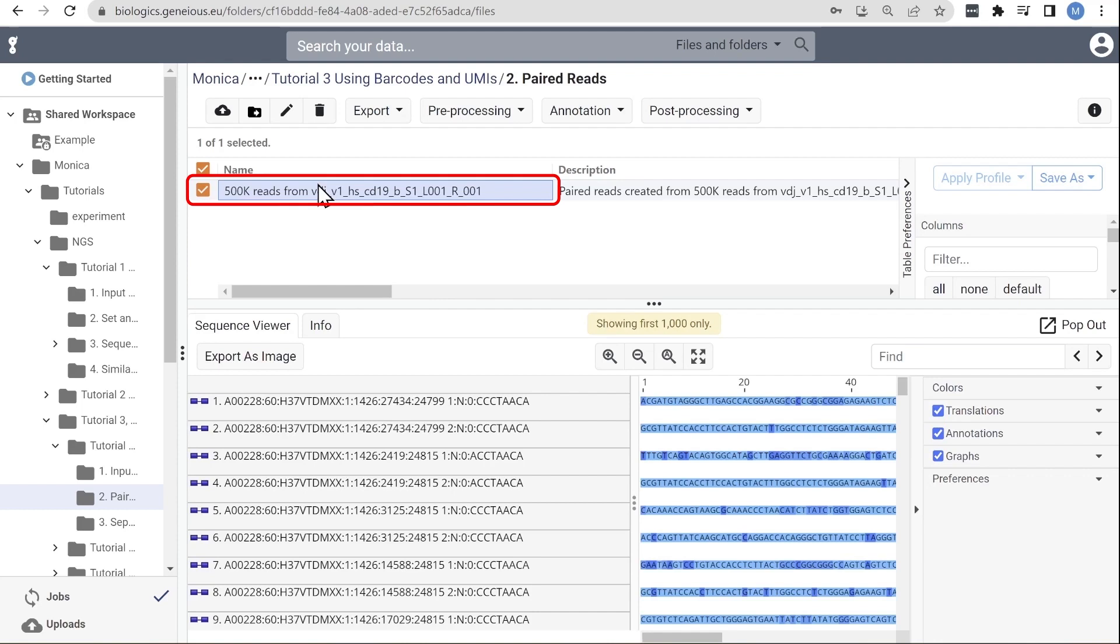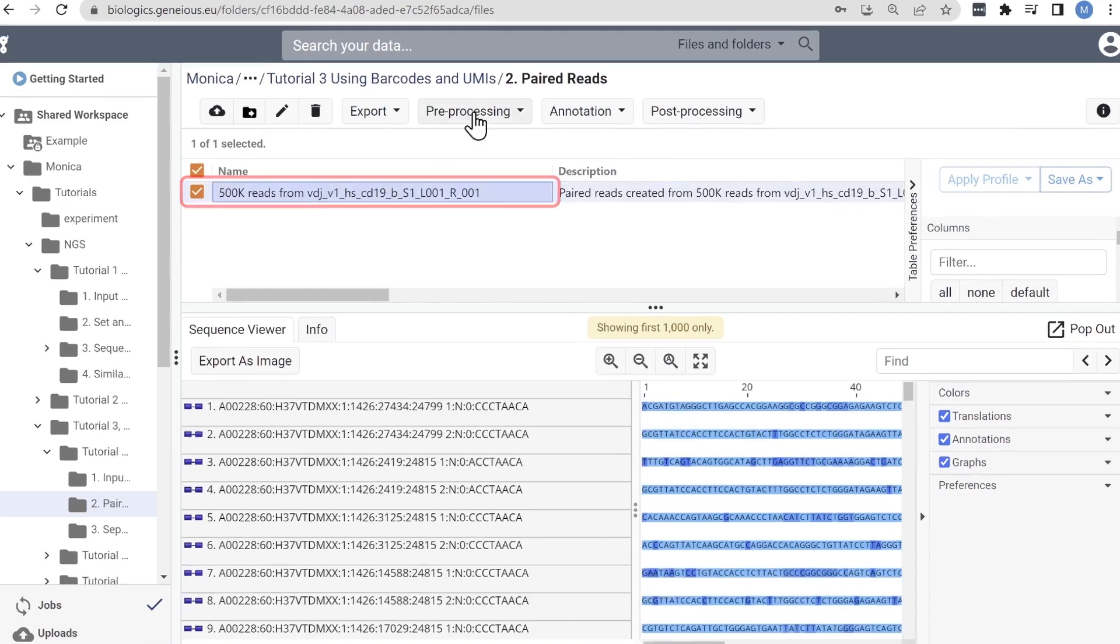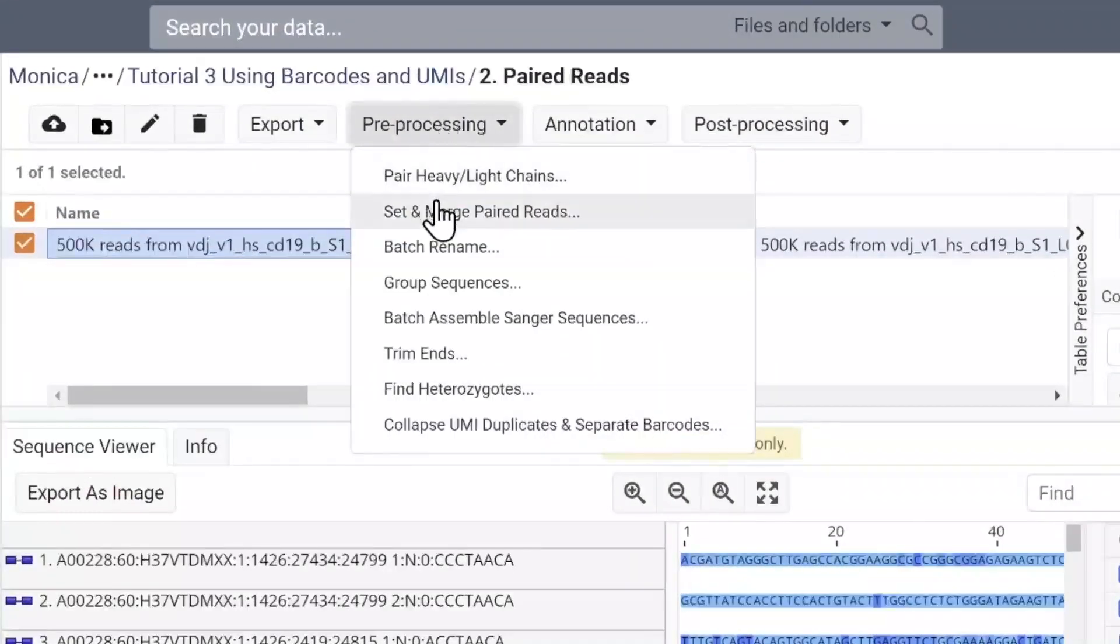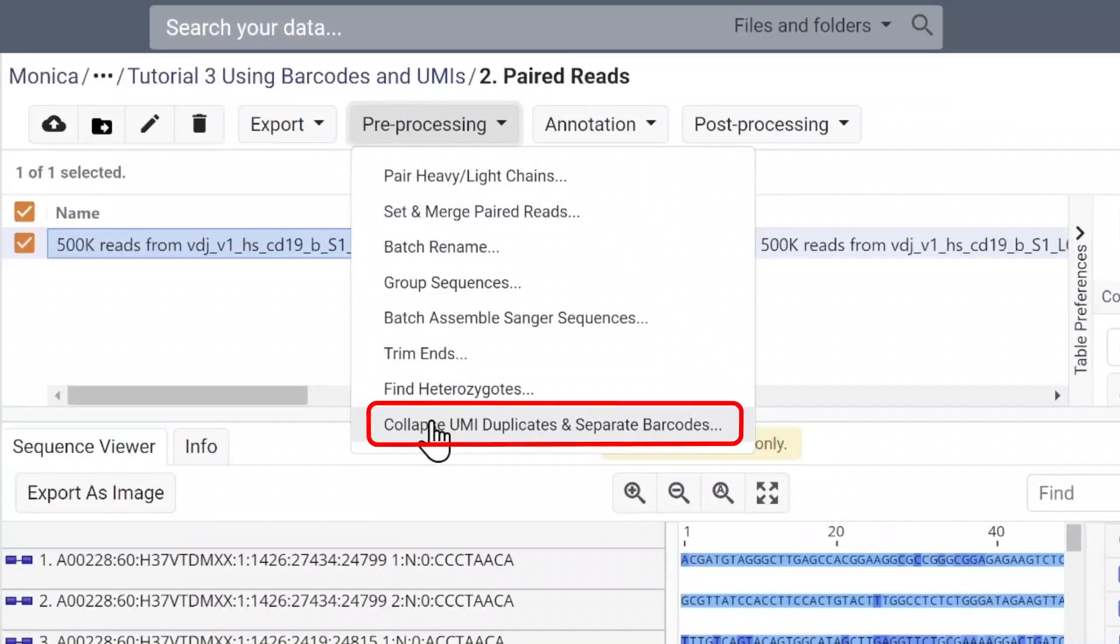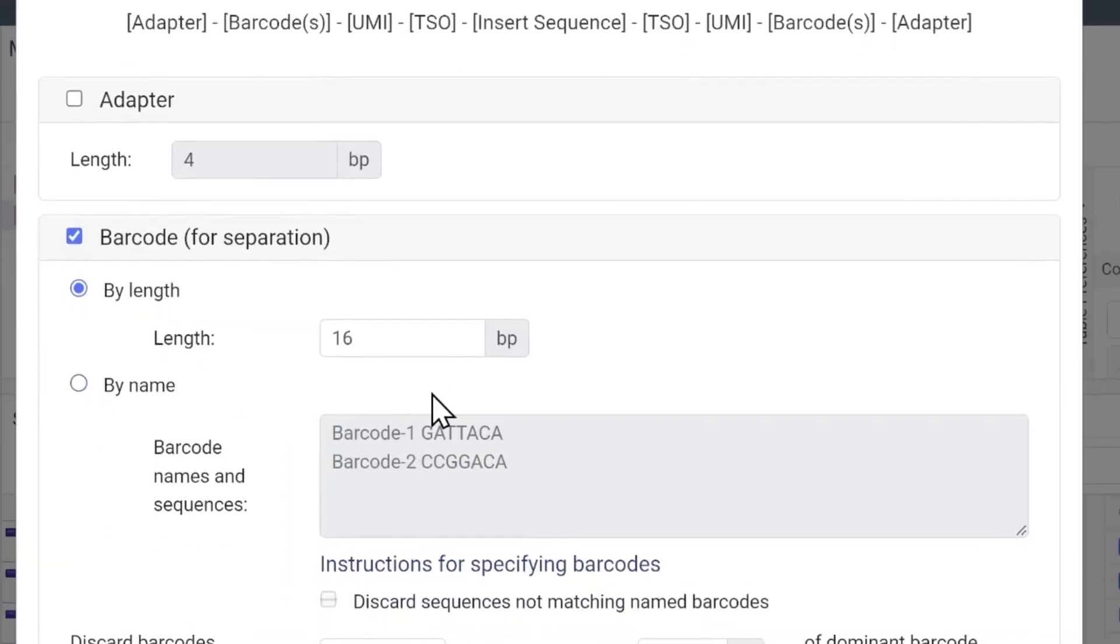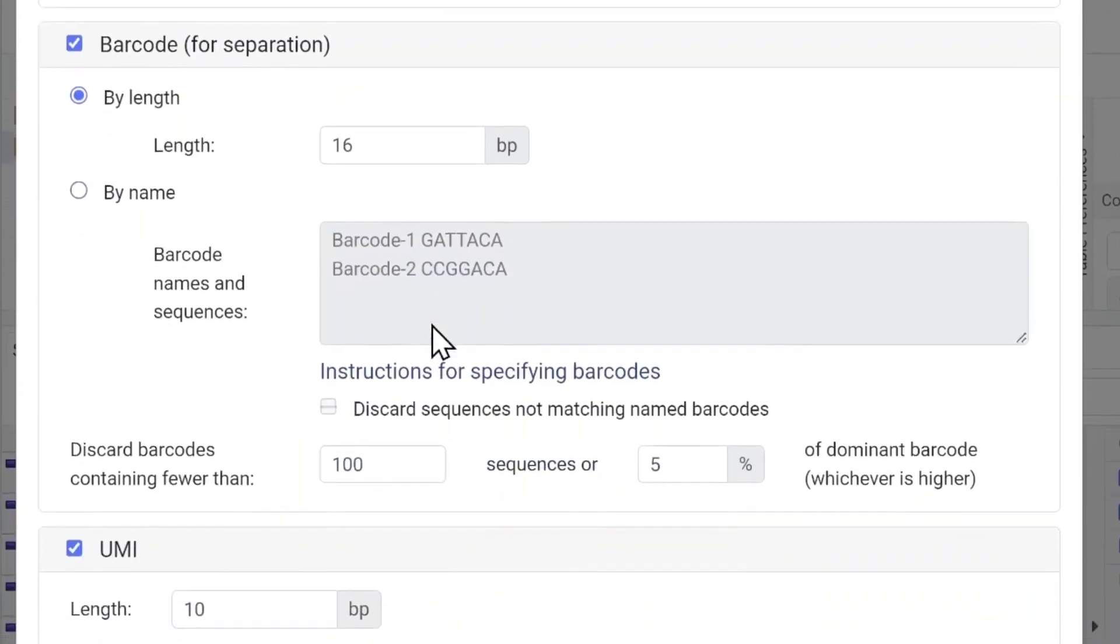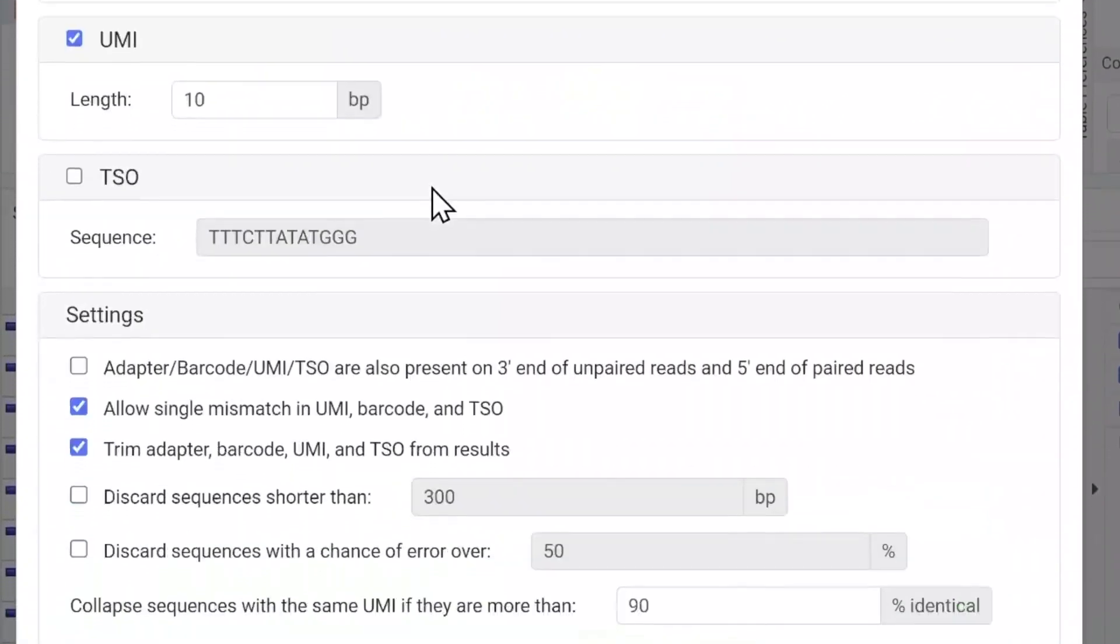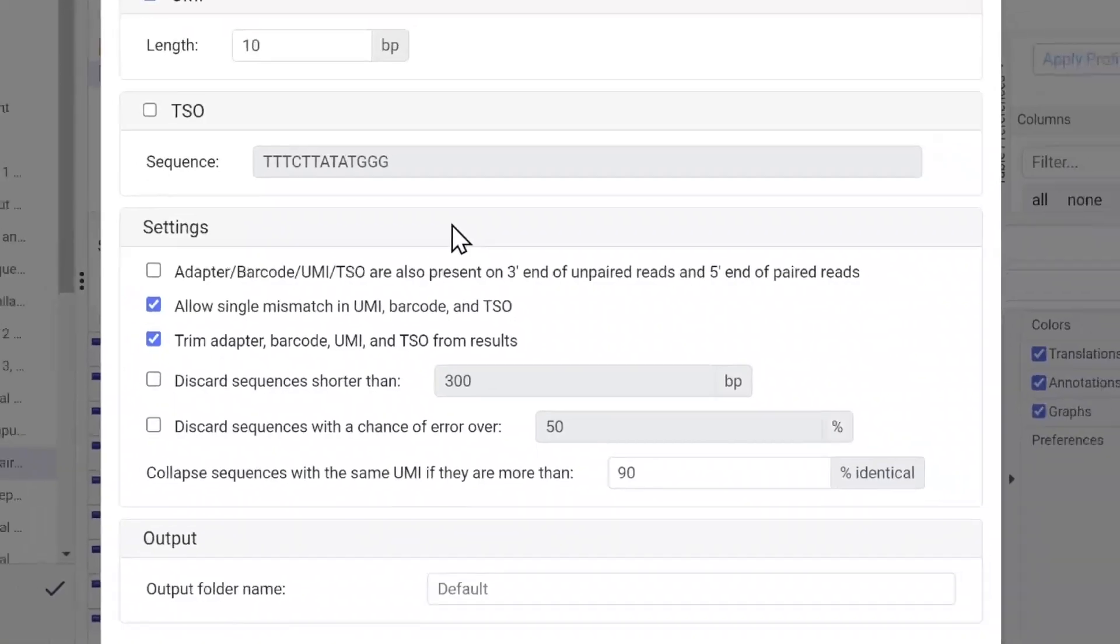To process these sequences in Geneious Biologics, select your paired read document and click Pre-processing. Then select Collapse UMI Duplicates and Separate Barcodes. We need some prior knowledge to fill this options menu in.